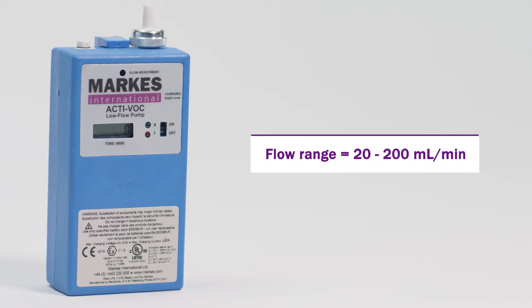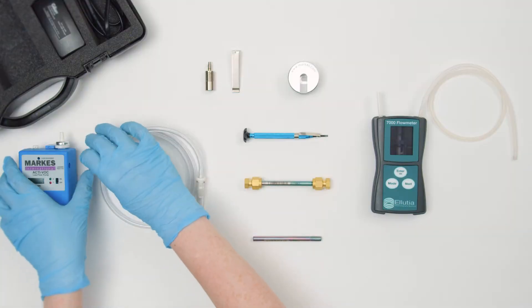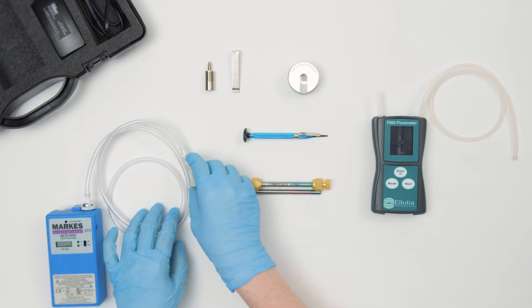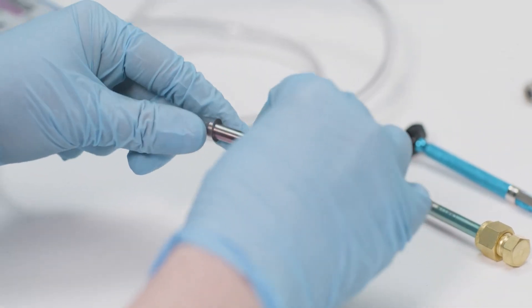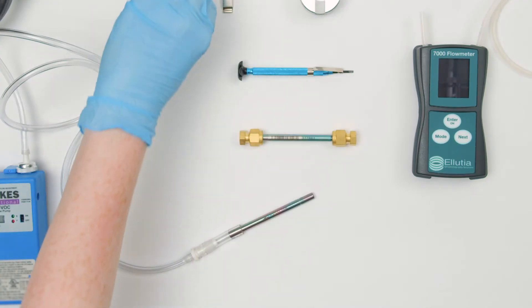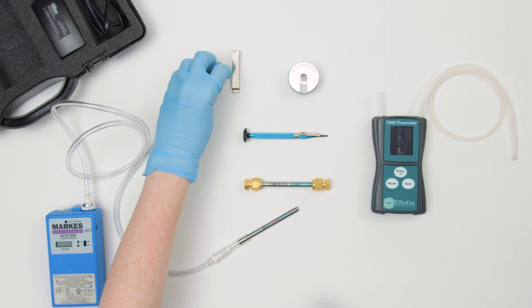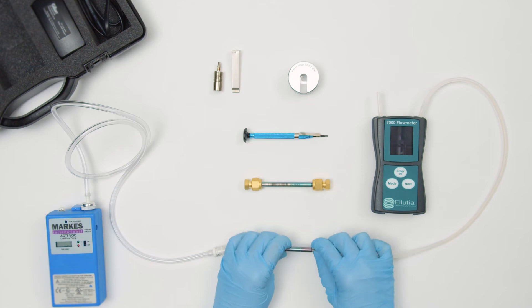The pump has a flow range of 20 to 200 milliliters per minute. To calibrate, attach the tubing and 1/8 inch tubing adapter. Push your sorbent tube for calibration into the adapter. The sampling arrow should be pointing towards the pump. When working with flows below 100 milliliters per minute, the back pressure adapter is recommended in place of the 1/8 inch tubing adapter. The next step is to connect the sampling end of the sorbent tube to a suitable flow meter.